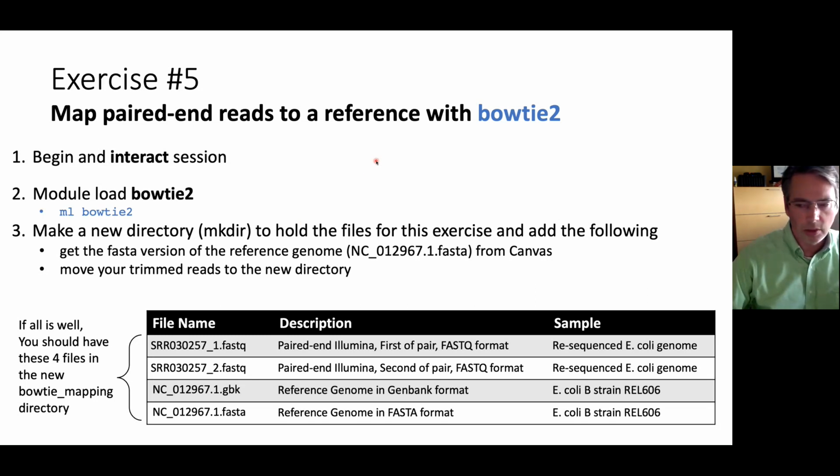That's partly just because this is the data set that the TAC group generated, but because it's a small genome, these exercises should go fast enough to finish during class time and in Interact sessions, so we won't have to use Slurm job scripts to do this.